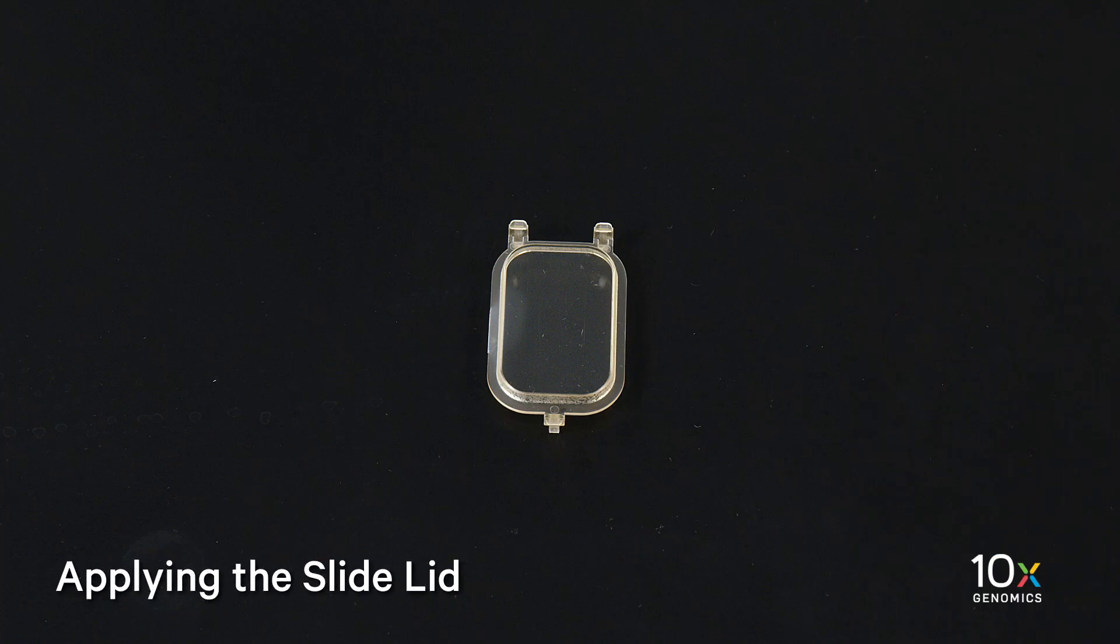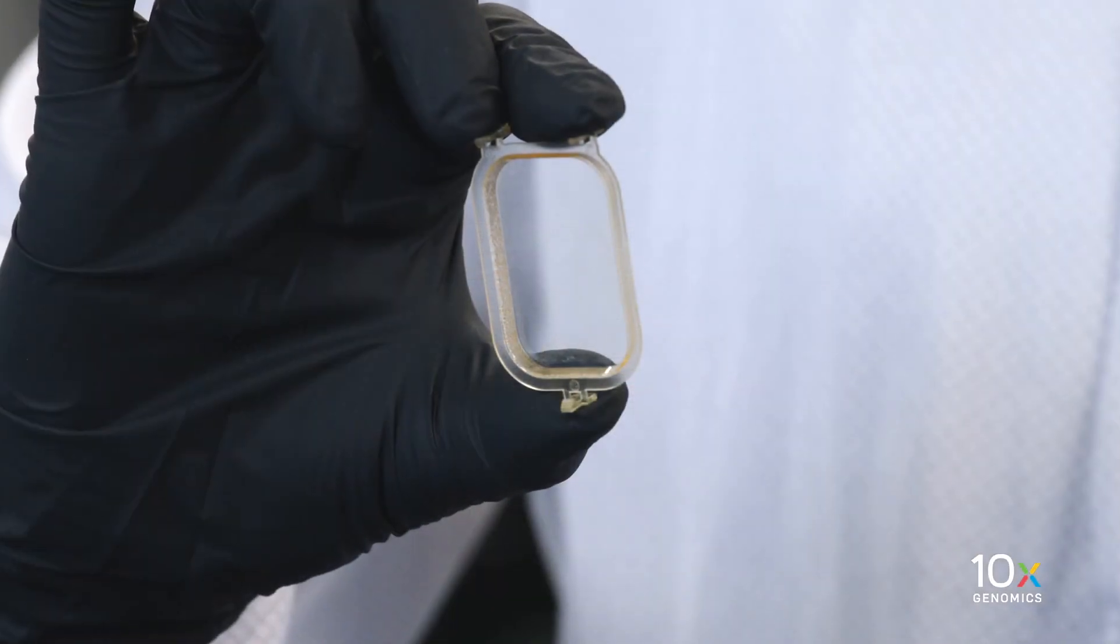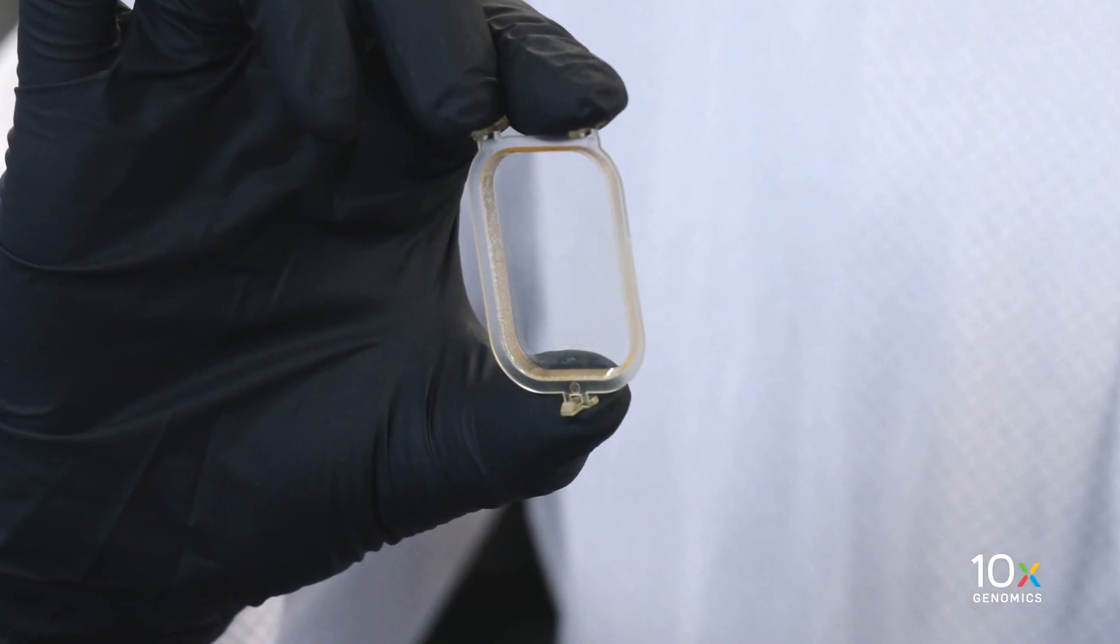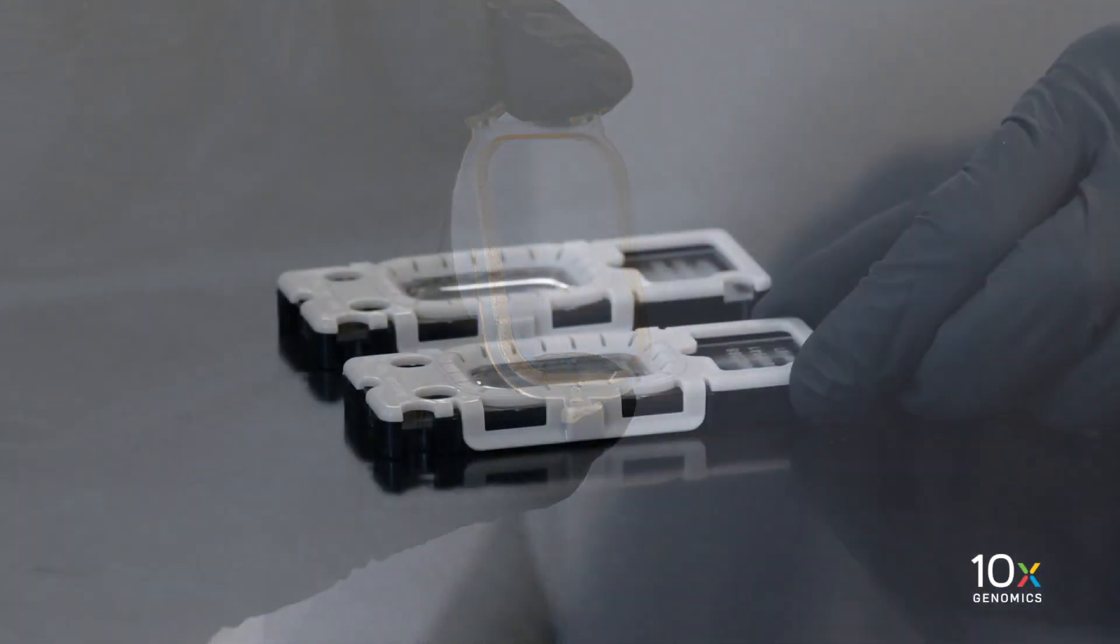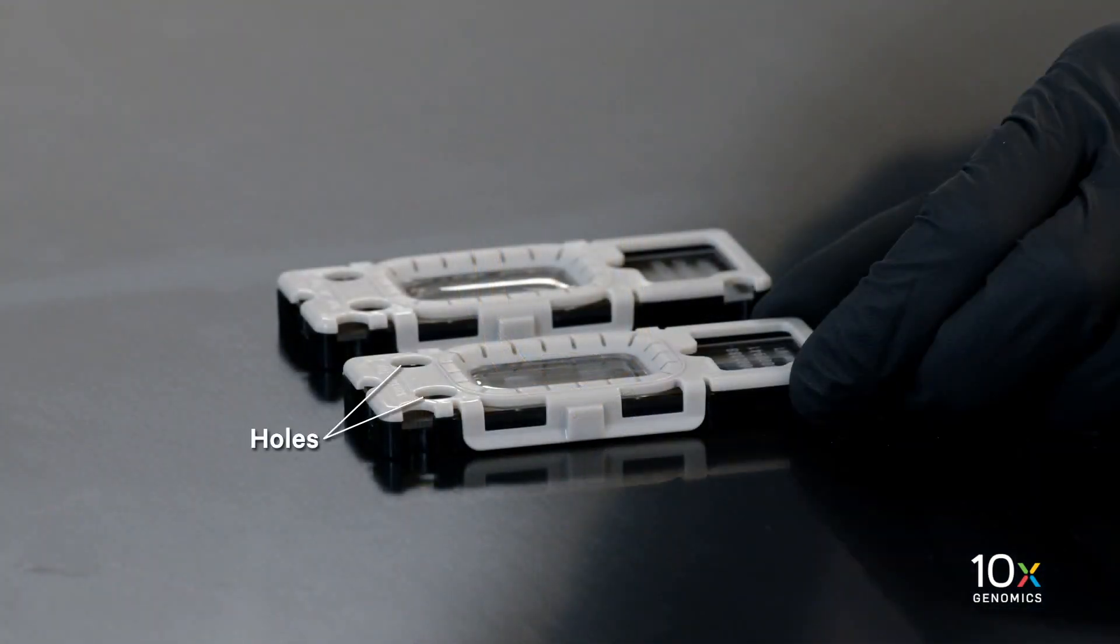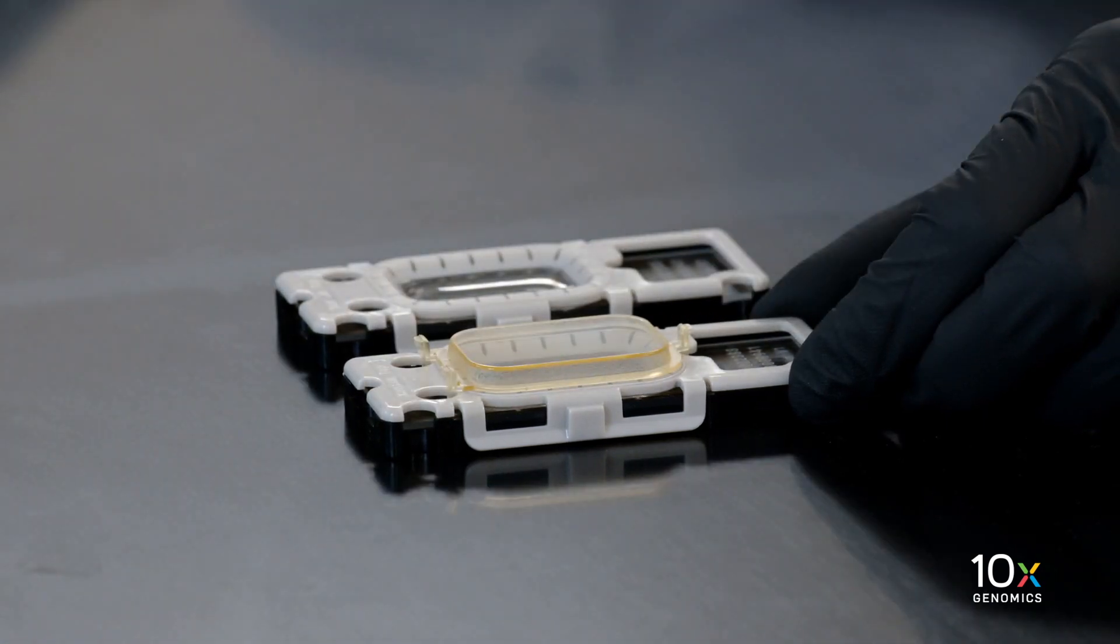Prior to incubation on a thermal cycler, we will apply cassette lid to the slide cassette. Place the Xenium cassette flat on a clean work surface. Hold the Xenium cassette lid with index and middle finger on two upper tabs and thumb on the lower clip. Hook the two upper clips into the two holes on the top of the cassette. Push the lid down until the lower clip clicks into place.